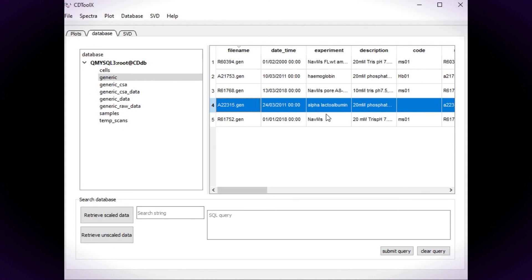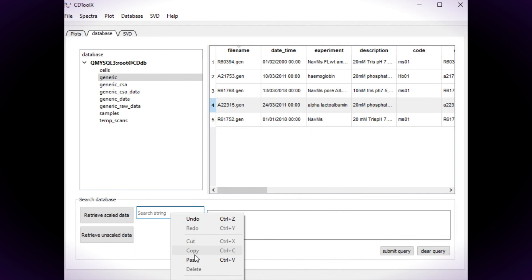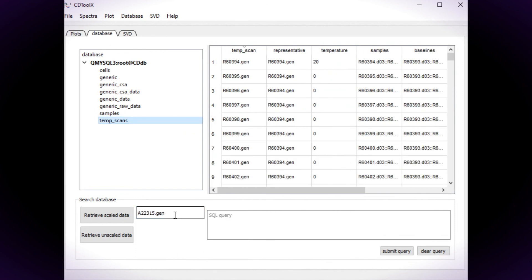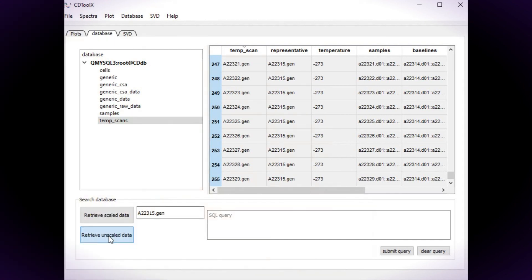To retrieve data series, copy the file name of the representative to the search box. Select the Temperature Scans table. Select the search box and press Enter. The spectra associated with the file name are now highlighted and can be retrieved in the usual way.